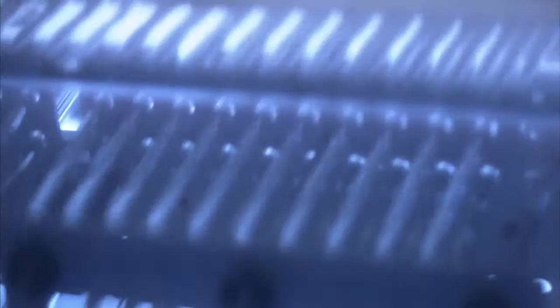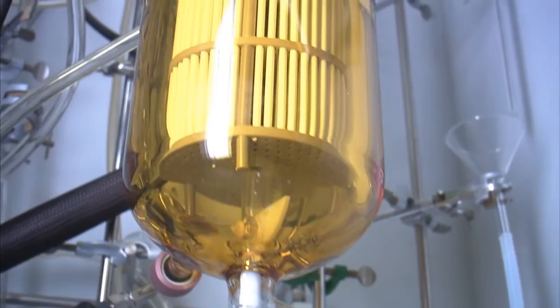A Chromolith monolithic silica column is made of a continuous piece of porous silica utilizing a sol-gel process, leading to a porous structure of defined size macro and meso pores, providing 80 percent porosity of such a column.